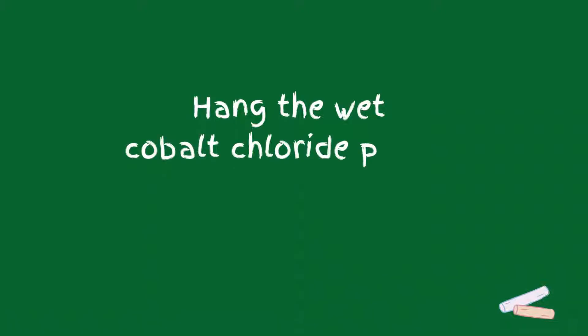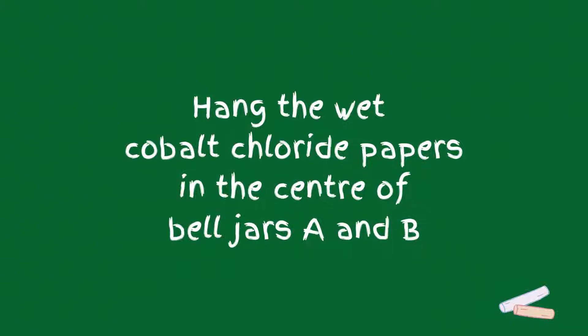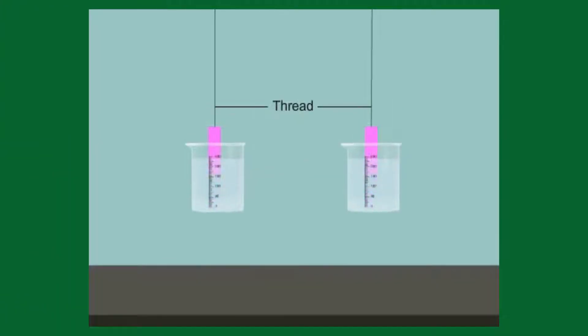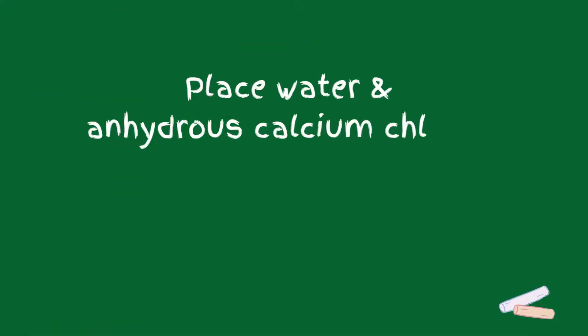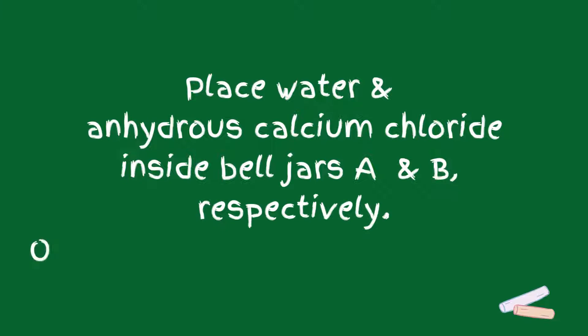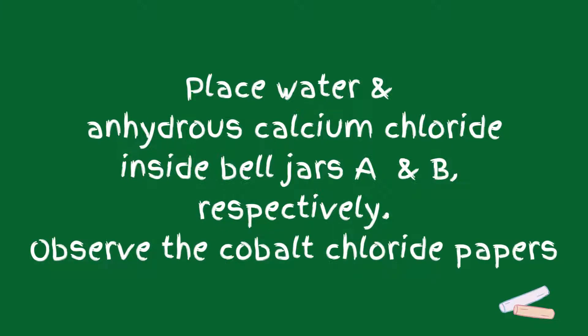First, hang the wet cobalt chloride papers in the center of bell jars A and B. Place water and anhydrous calcium chloride inside bell jars A and B, respectively.